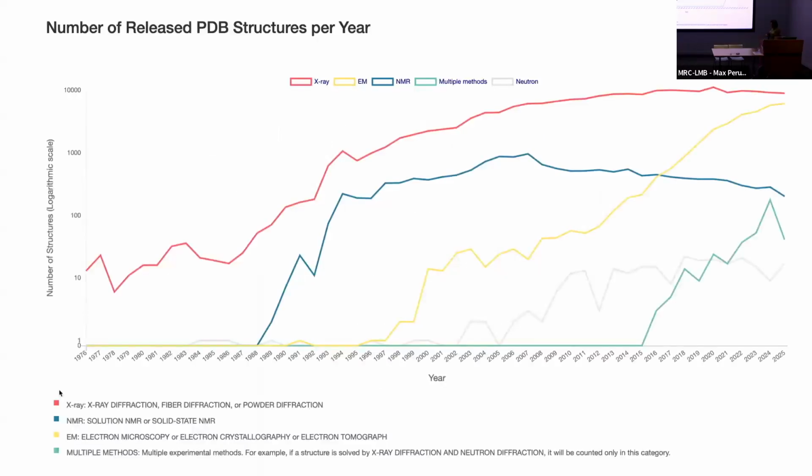I want to give you some facts. This is from the PDB, the Protein Data Bank, which updates almost every week; I took this yesterday. These are the structures deposited into this database with three major techniques or methods to obtain structure.